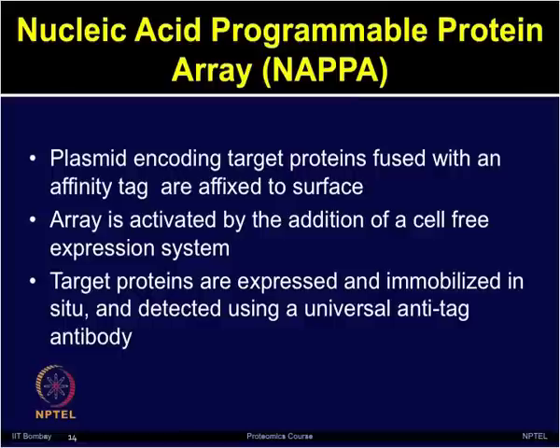The target proteins after expression are immobilized in situ and detected by using a universal anti-tag antibody. In this case mostly anti-GST tag is used, but one can use any other tag and the corresponding antibodies can be used.